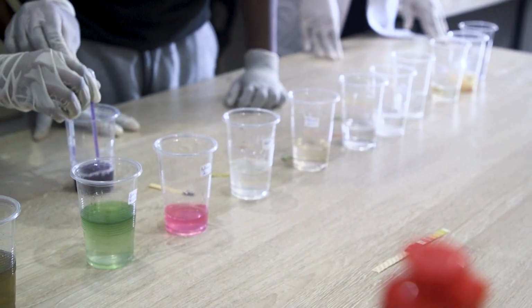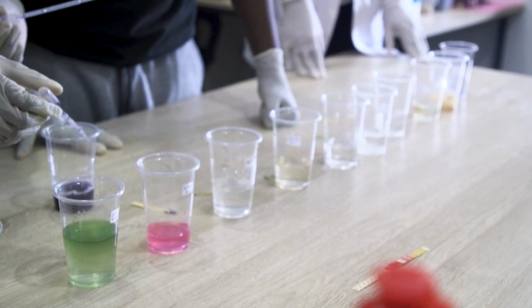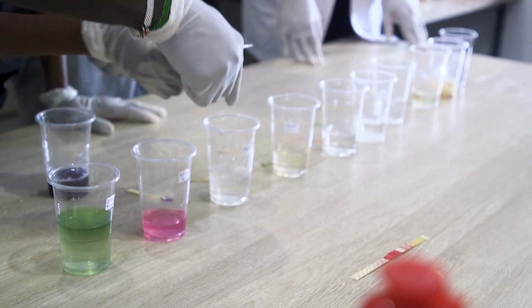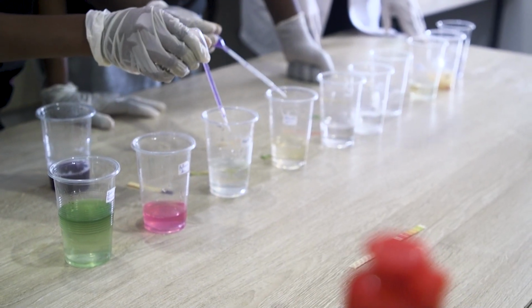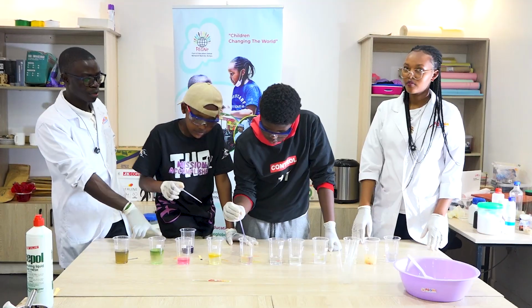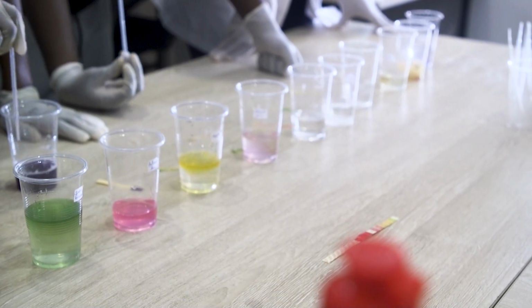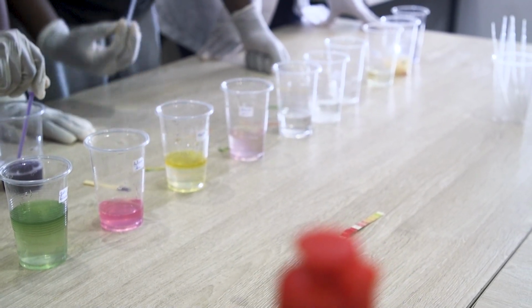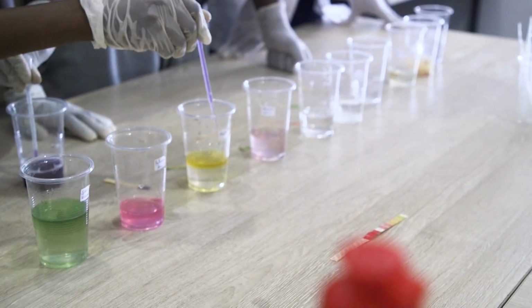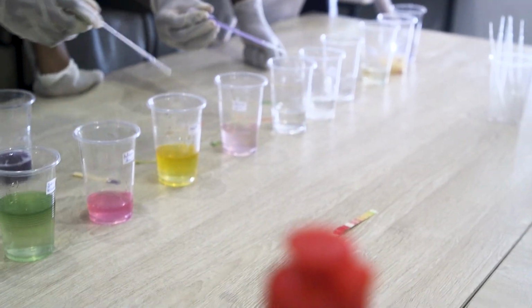Okay, then I take some. Wait, let me take some. Good. And then drop it inside here. This one. Then let's see the color change. Which color is that? Yellow. It's yellow. Now yellow from purple. And that one is also pink. Good. Then we go to the next. Wait. This other. Still, it's really yellow.